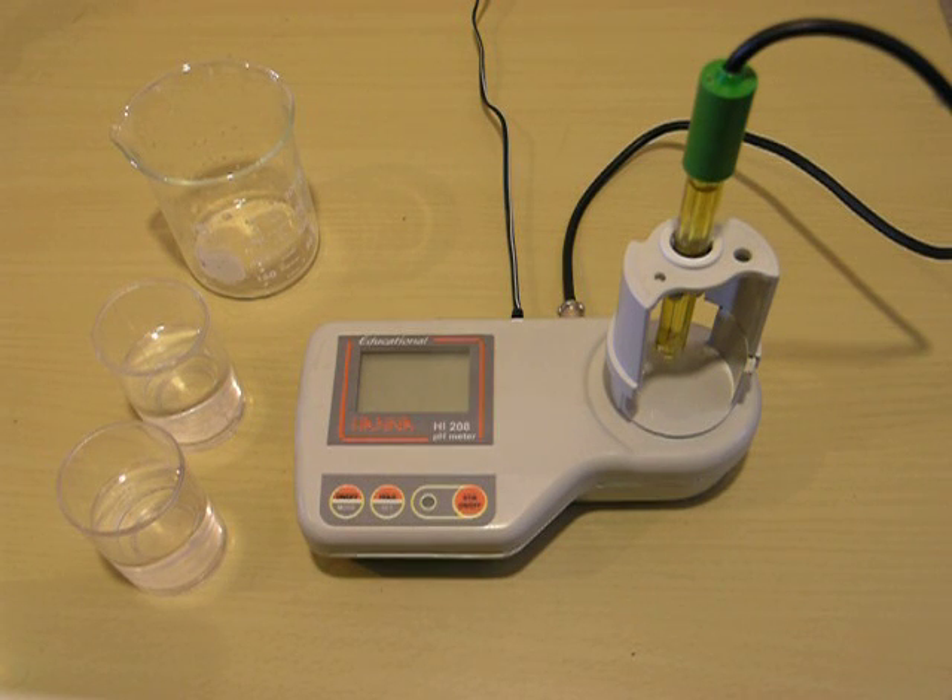Welcome back to Hanna Instruments. Today we're going to be doing the calibration for the HI208 pH meter. It's a meter with a built-in stirrer and automatic temperature compensation. It can be run with either batteries or 110 power. I currently have it plugged into the wall.